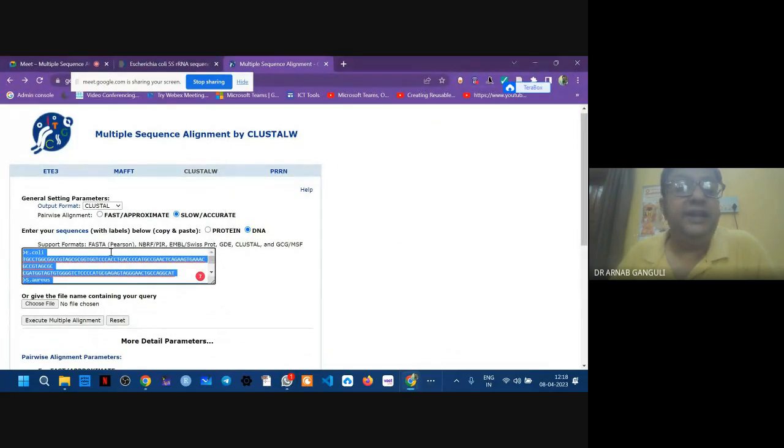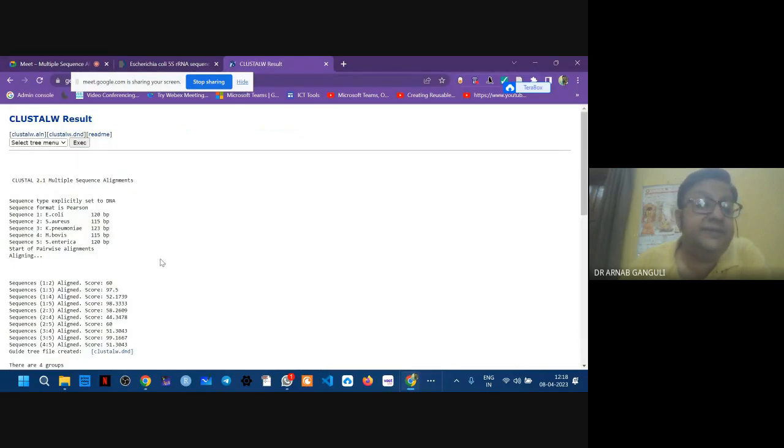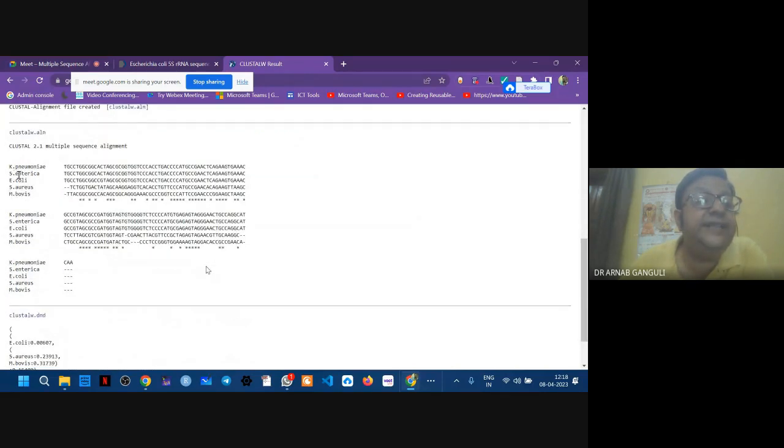I'm using DNA sequences, not protein. Or let's do fast approximate. Execute multiple alignment. You see the multiple alignment: K. pneumoniae, S. enterica, E. coli. Yes, here. Are you seeing the stars over here? Yes, sir.